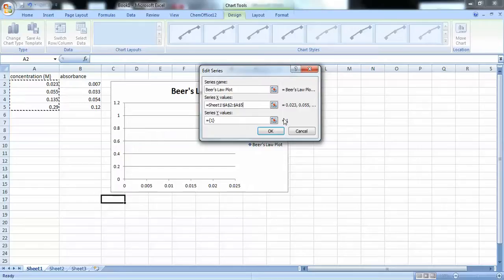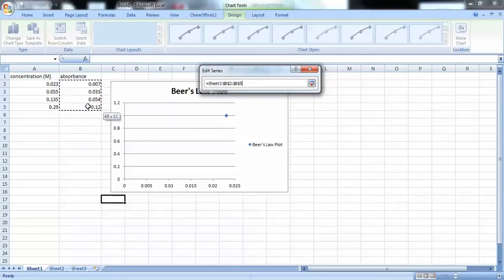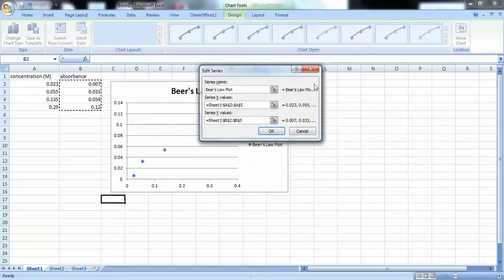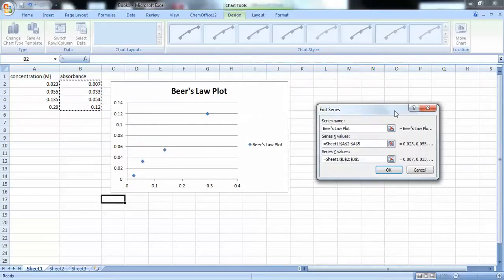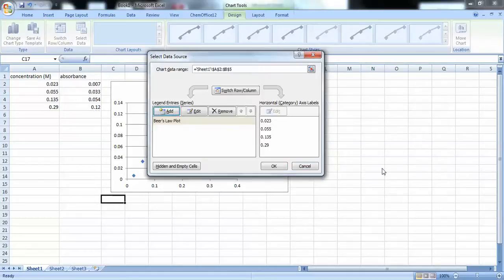And we'll do the same thing for the Y values. Click on the window, highlight our absorbances, and then click on the window again. And you should get a plot that looks sort of like this. Click OK twice.